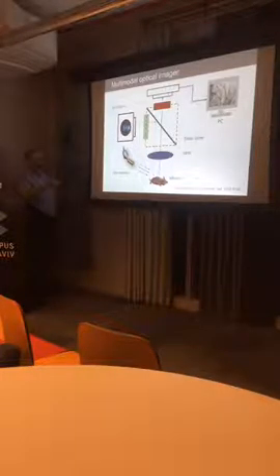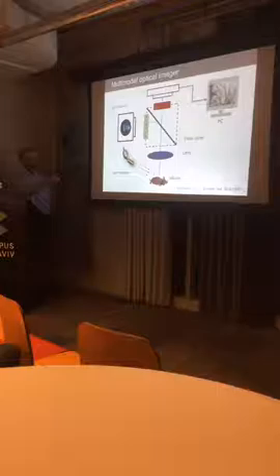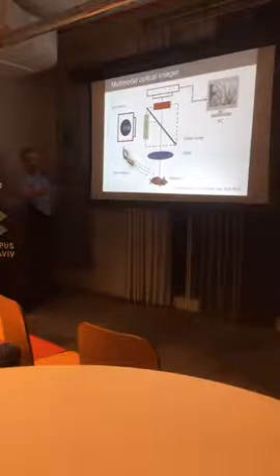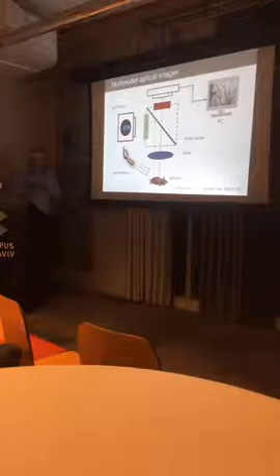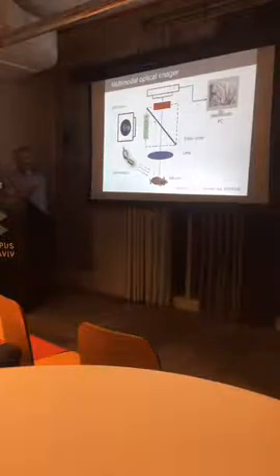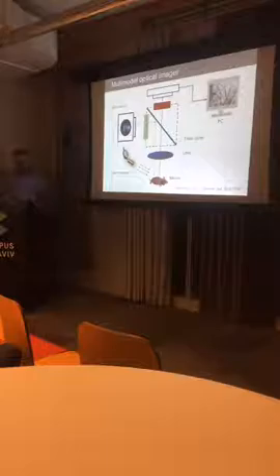We use the light source, the fluorescent light source like an LED, for fluorescence. This is the excitation filter, sorry, this is the emission filter, and this is a mirror to combine both lights together. And this is the laser that illuminates the animal, not with a single point, but like a diffused light. Then we collect using a CCD camera or CMOS camera. CMOS is much cheaper. And then we have a computer to analyze this data, and I will show how, and I will show what we can get.